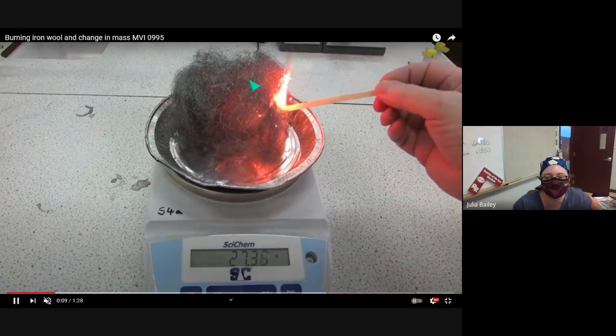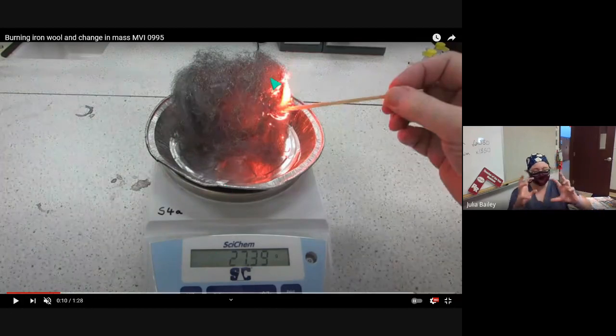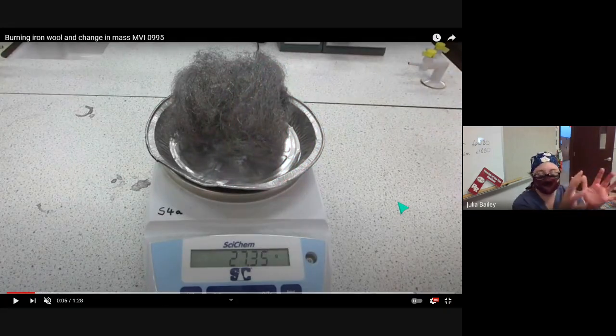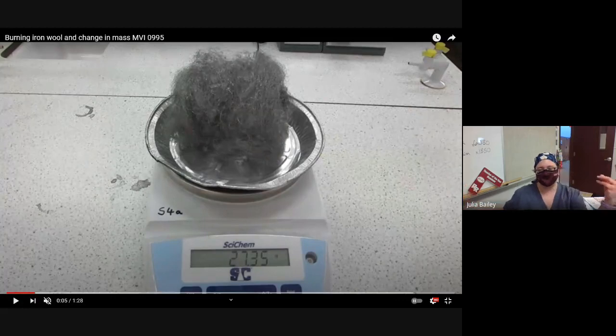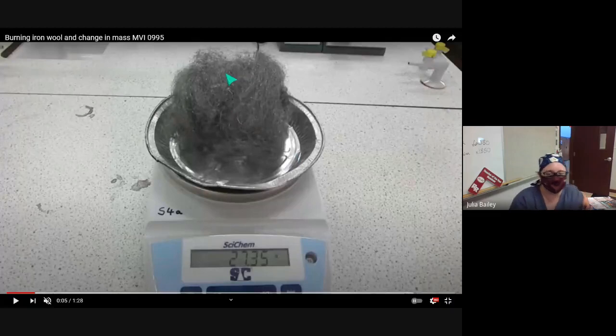You see that they've got a scale. There's a pie tin on it, and there's a big ball of steel wool sitting in the pie tin. If you don't know what steel wool is, it's steel, like metal, and they pull it into really, really thin wires, and then they tangle it up. So it feels kind of like raw wool, like when you shave a sheep, right? Except it's sharp. It's just this big ball of tangled wires, basically. And we can see at the beginning of the video that the steel wool starts at 27.35 grams.